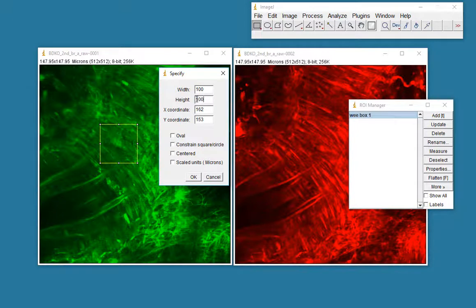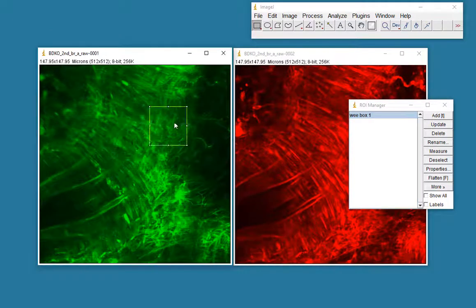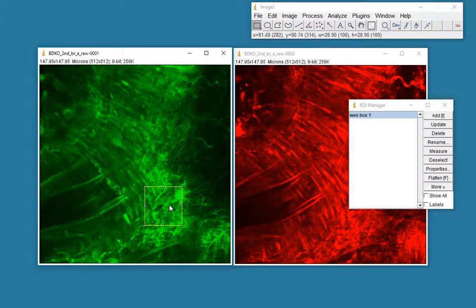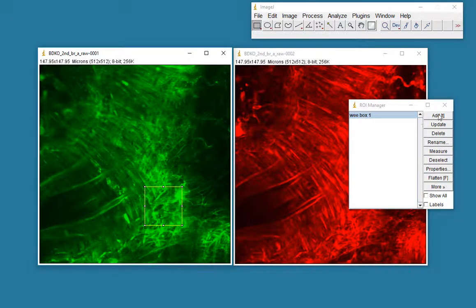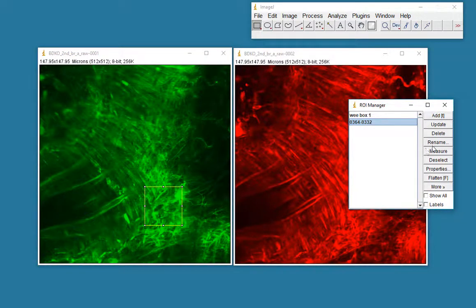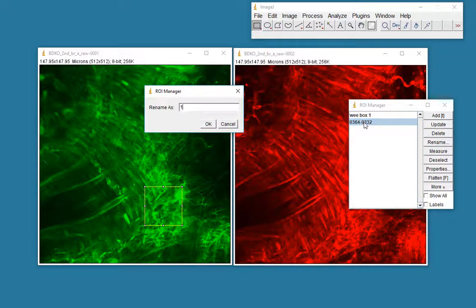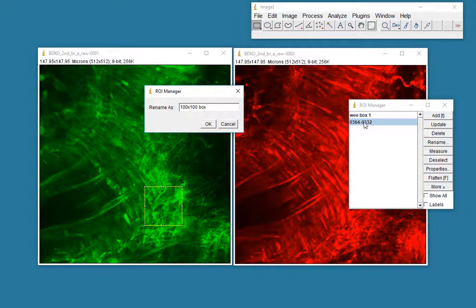That's a decent sized box. I'm going to move that, let's say, to somewhere here in this image. I'm going to add that. And I'll select that and rename it. And we'll call it 100 by 100 box.